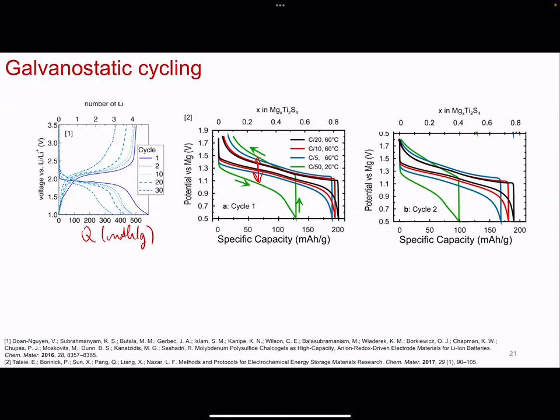So this is why you see a number of representations of the galvanostatic cycling plots the way you do, and sometimes it's also historic, but you plot for what you want to show first and communicate. This is also particularly useful in both representations. You'll see that you can track the capacity fade pretty readily because you can just look at the axis crossing and you see, okay, this is per cycle at the same C rate.